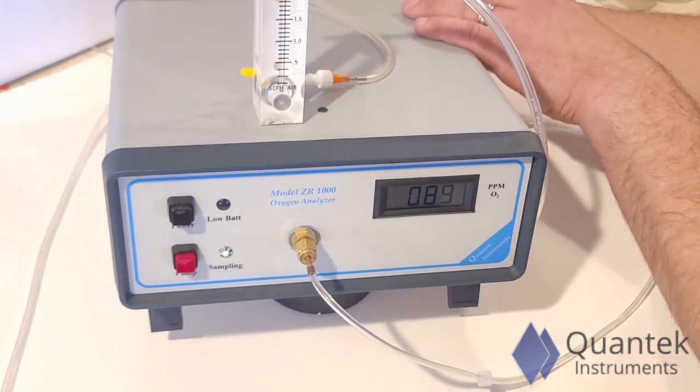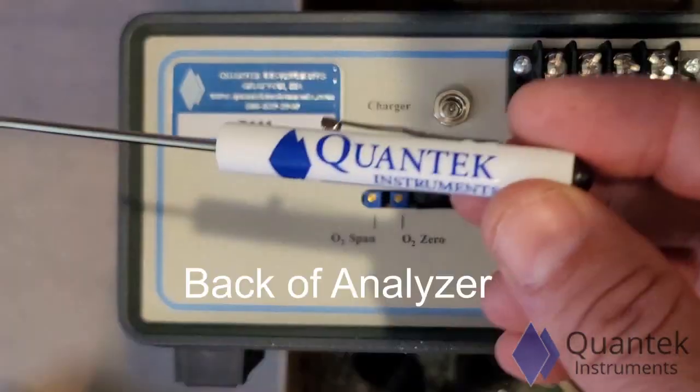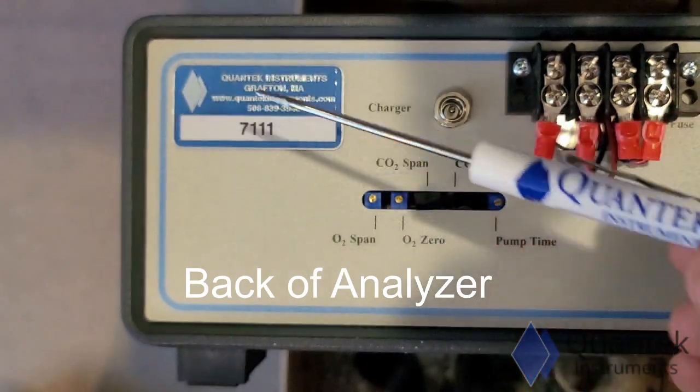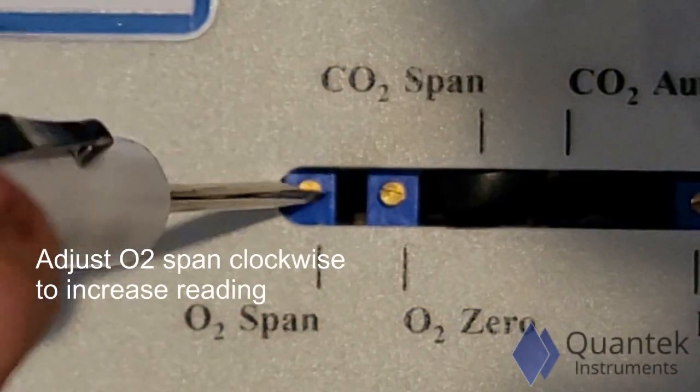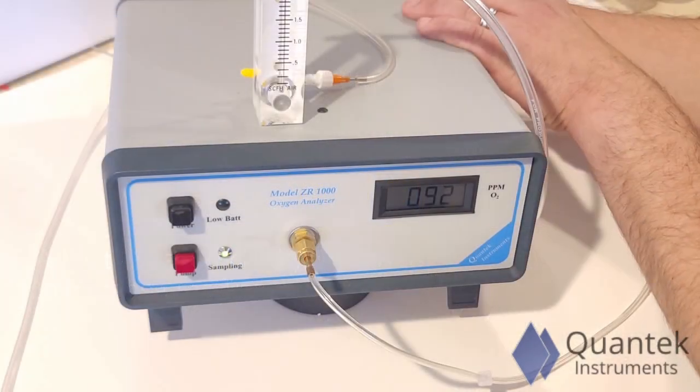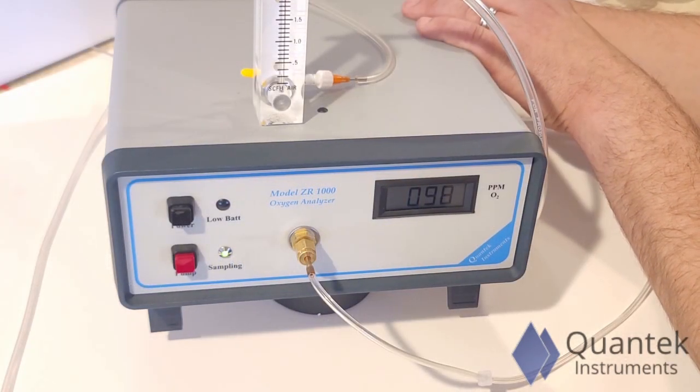Activate the pump. The reading is a little low, so we'll adjust the O2 span clockwise so that the instrument reads 100 ppm. Our calibration is complete.